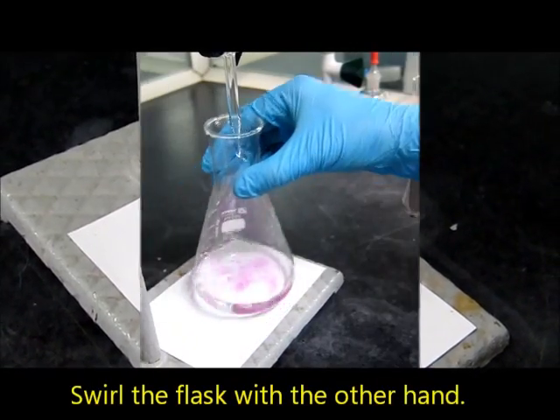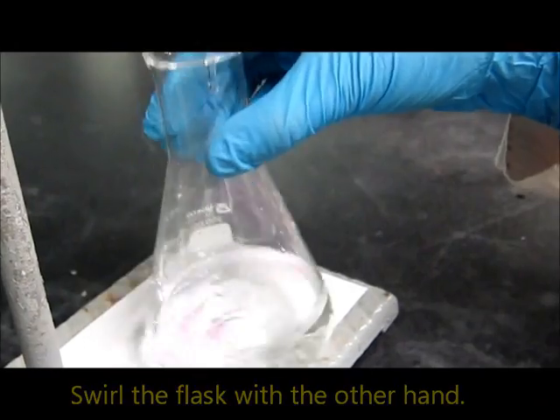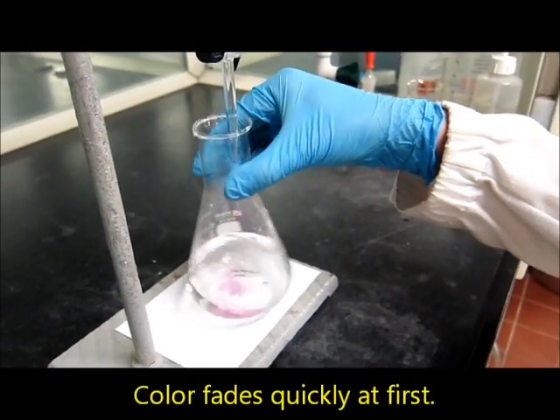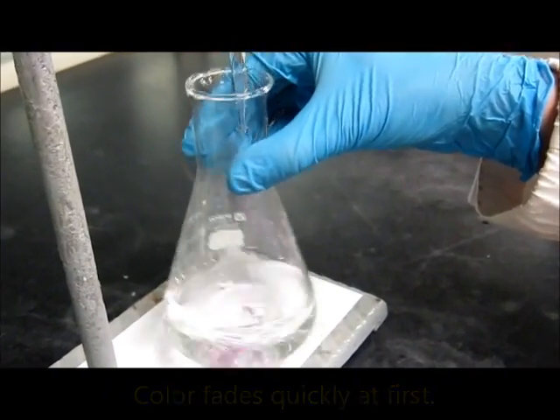It gets a bit pink for a moment. And continue to swirl the flask with the other hand doing non-stop. Then you see the colour fades quickly at first.